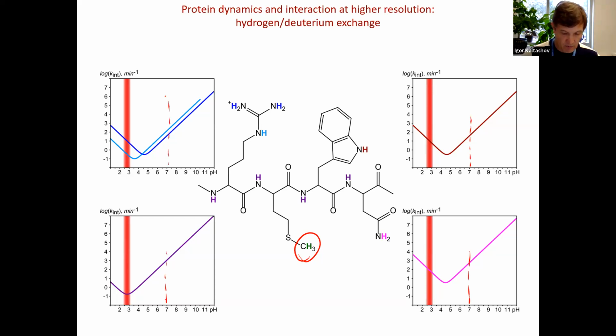And for all types of hydrogens, this is a pretty fast process. Now, the one type of hydrogen atom that we are particularly interested in is amide hydrogens. The reason is that they're uniformly distributed across the polypeptide backbone, right? Proline is the only amino acid that doesn't have an amide hydrogen. And so with the exception of proline, for each residue, we have a single reporter, which is great.